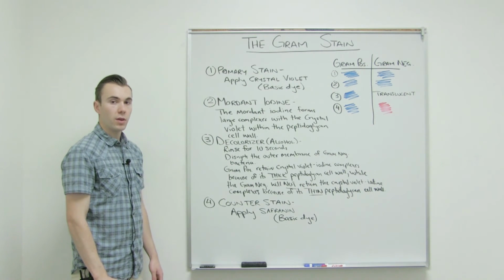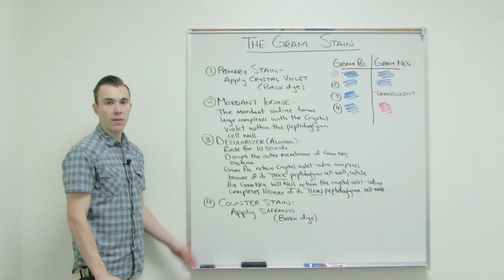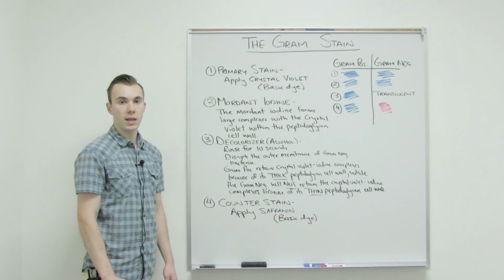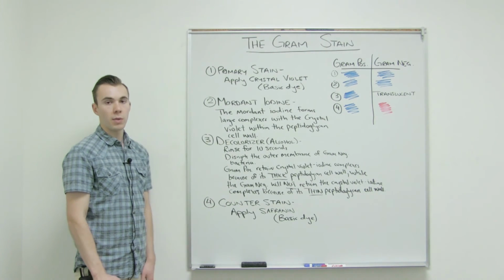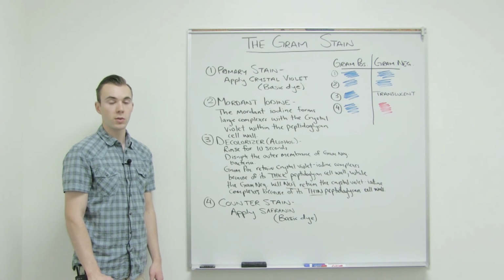While the gram-negative lost all its color during the 3rd step, and so therefore when you apply the safranin, it is going to completely absorb the safranin and it's going to stay a red color. You look at these results under the microscope. So you do the whole process and then you'll look under the microscope and see results.